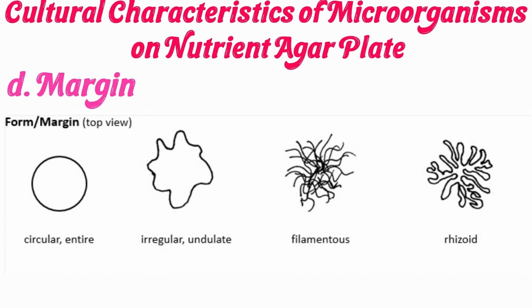Remember that form describes the entire colony shape, whereas margin describes only the outer edge. This distinction is commonly tested in examinations.